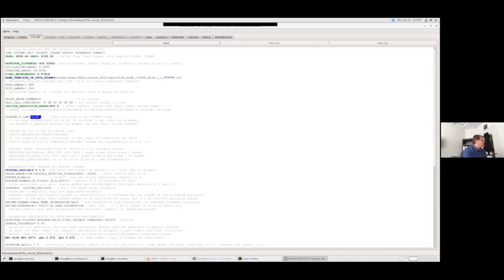And this condition is true if you don't have an anomalous scatterer. And generally, you know if you have an anomalous scatterer because you've done something to your crystal setup, either your protein prep or your crystal setup, to include something that's going to diffract anomalously. So we can change this to true because we know we're just doing what's called native data.